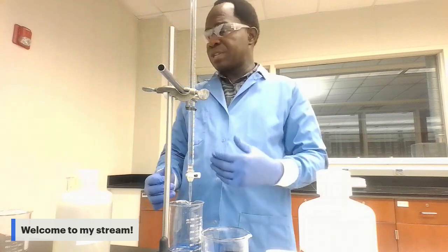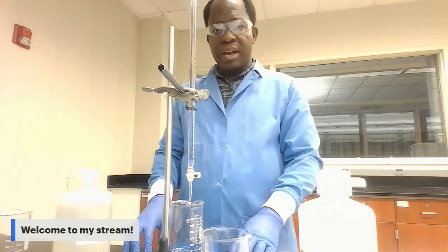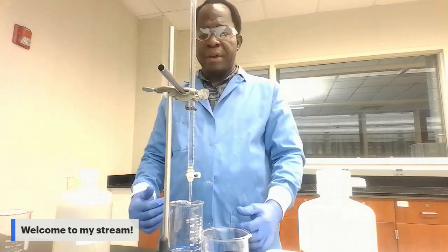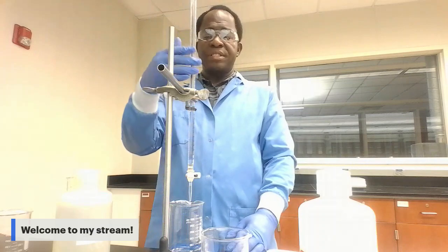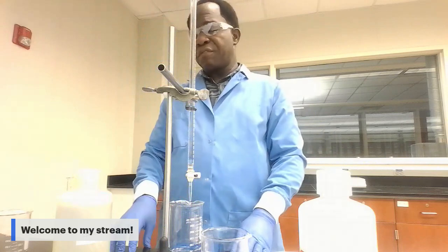I did this process before starting this video. You fill it with HCl and then you drain it out. That's how you clean your burette. After your burette is clean, you can fill it up with a new solution of HCl.